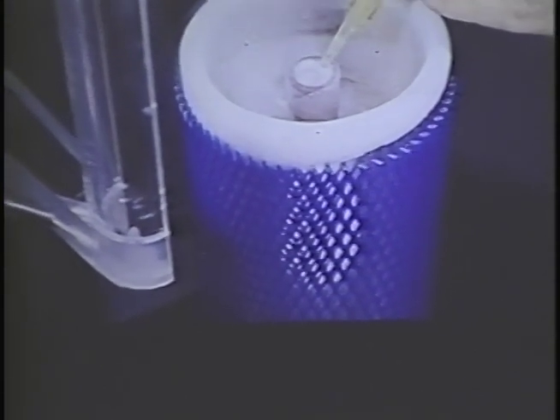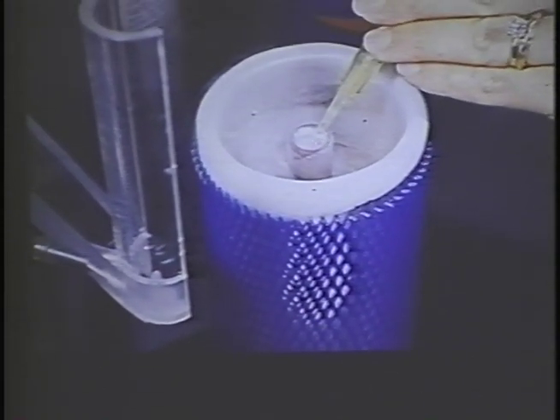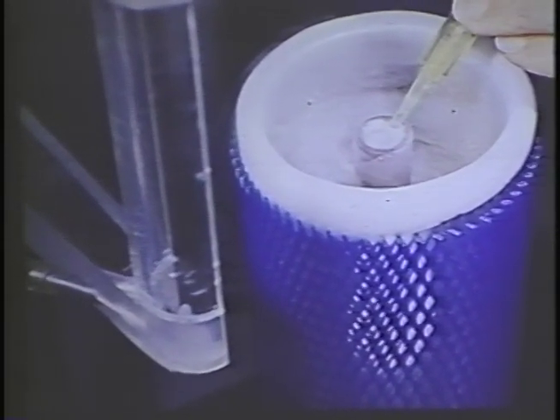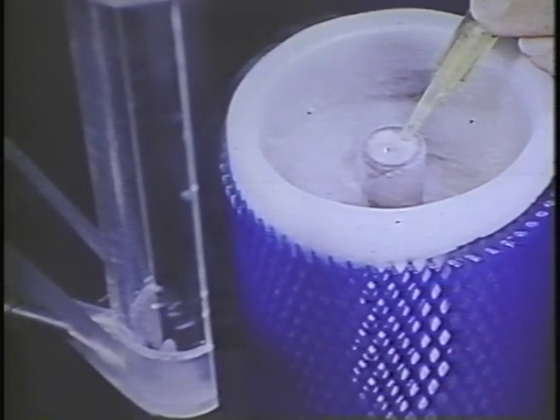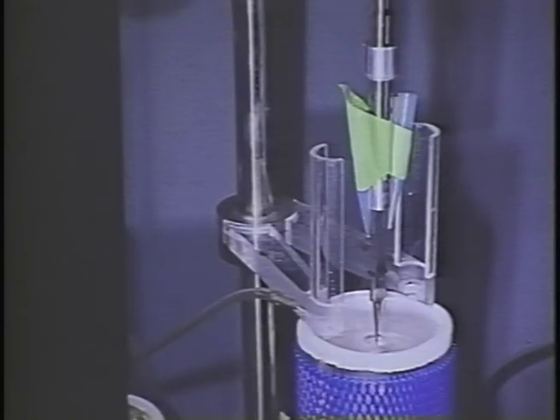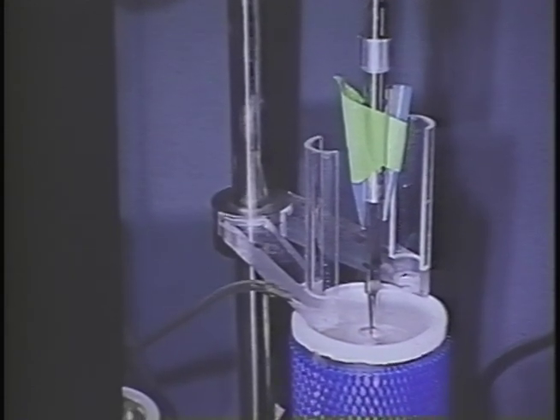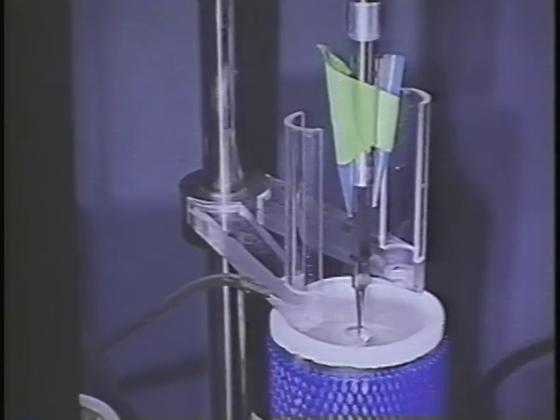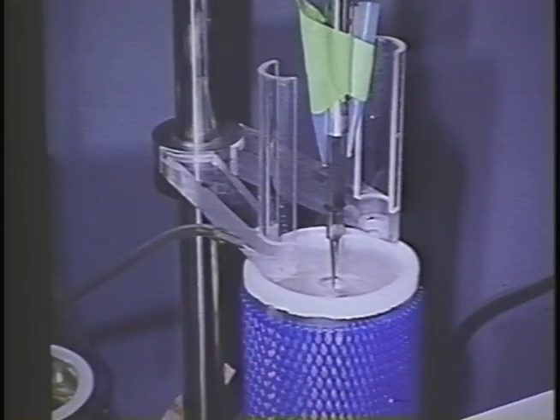The forceps are mounted over a vessel of ethane, which is liquefied in a liquid nitrogen cooling bath, and I add fresh ethane before each freezing run. Next slide. The blotted grid is then quickly plunged into the ethane using a quick release mechanism, and the ethane is held directly above its freezing point.